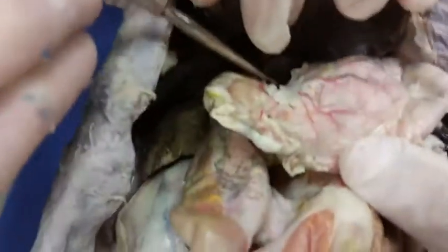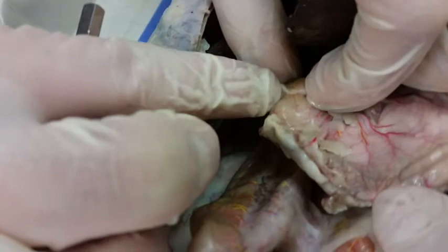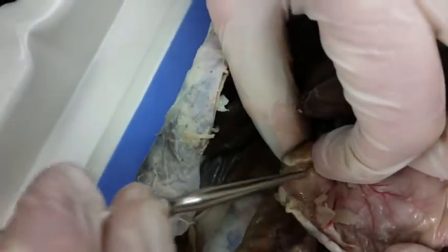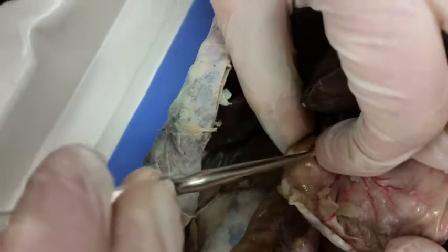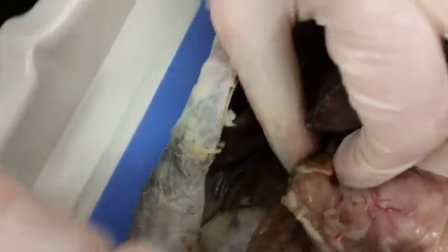Then we have the pyloric sphincter, which is right here. You can see where it narrows. If you feel it, it gets really, really hard. That's the pyloric sphincter, where the stomach transitions from stomach into duodenum.